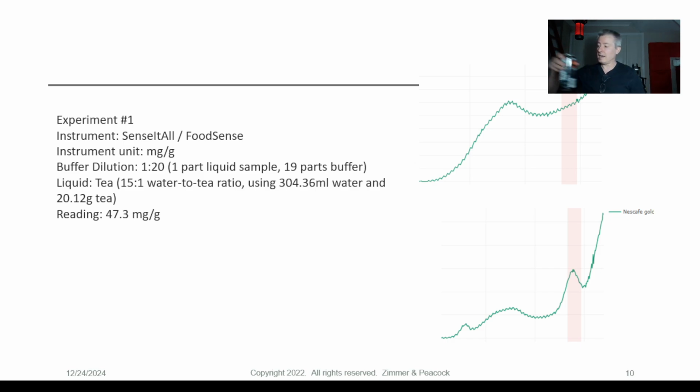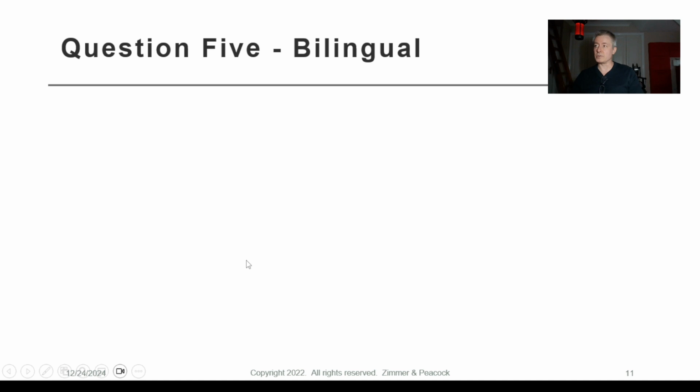Again, I'm not going to troubleshoot that now because I haven't tested these energy drinks myself. Though if I see the raw signal, and if I see the raw signal is flat, it tells me one thing, and if I see this peak for caffeine, that definitely tells me something else as well. It tells me that there's caffeine in there, and we can sort of deal with it.